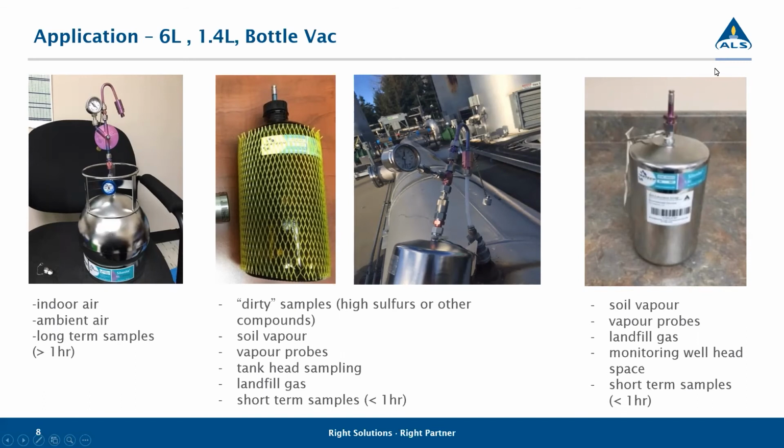So your flow controller is what you would attach your sampling train to, much as you can see here in the picture second from the right. The sampling train is attached, and then once that's all attached, you attach it to the top of the canister, you start your time, and you fill the canister up this way. The reason that the TOV valves are included on the 6-liter cans is because generally when you're doing a duplicate sampler, you co-locate them. And so you would put them side by side. And in order to start them simultaneously, you would make sure that valve is closed on both cans, install the flow controllers on top, so the time weighted average, and then with two hands open the TOV valves at the same time.